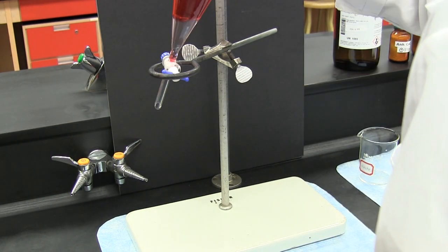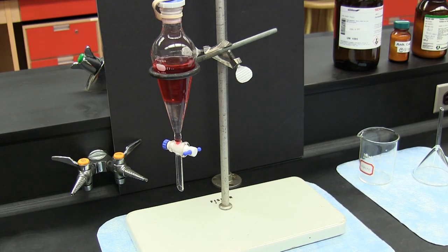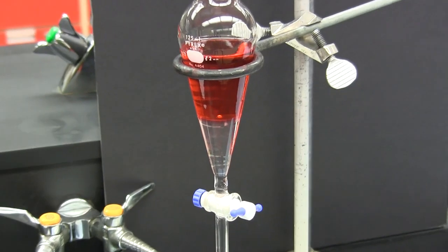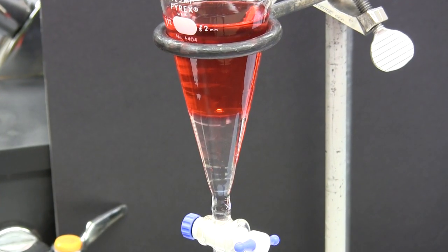Then, with the stopcock closed, the sep funnel is returned to the ring support and the two layers are allowed to separate. Here we can see the denser dichloromethane layer on the bottom and the water layer is on the top.